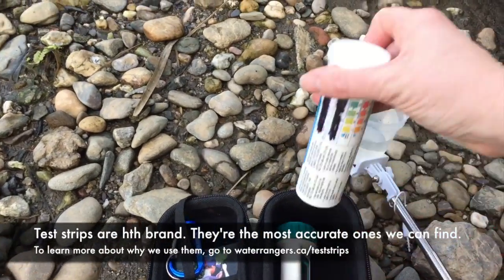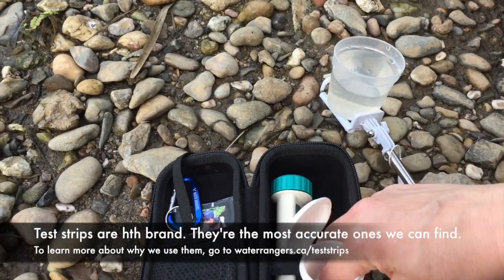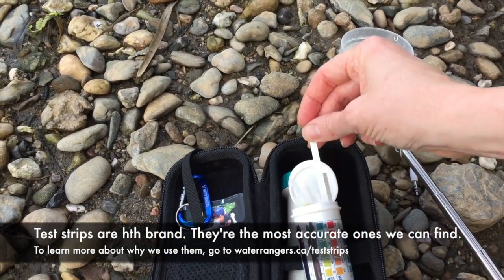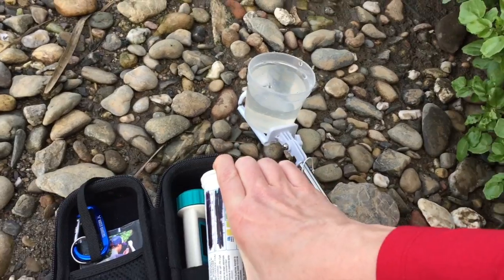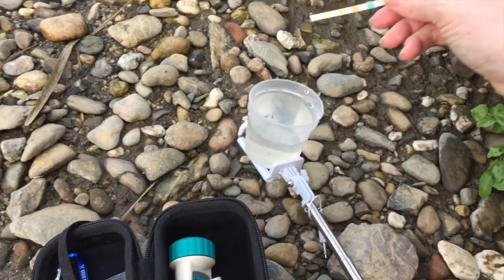First I'm going to do my test strips. These are pool test strips so you can buy these yourself — I highly recommend them. Make sure your hands are dry, take one strip out, and then close the cap immediately. You don't want to get water in here because you'll ruin them all. They're not that expensive, but still.